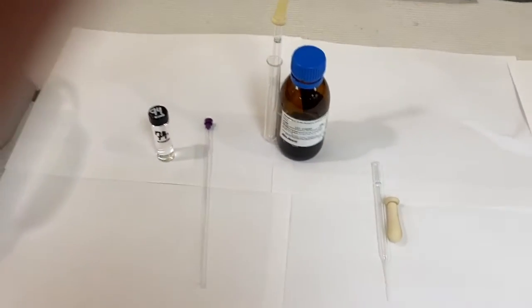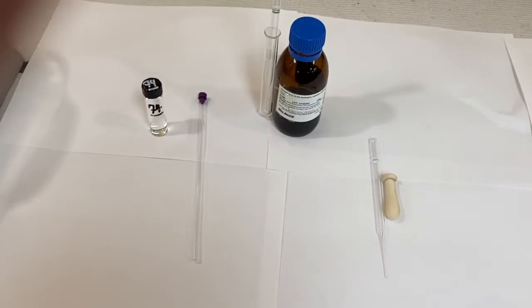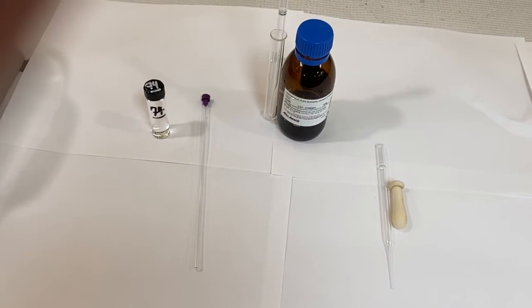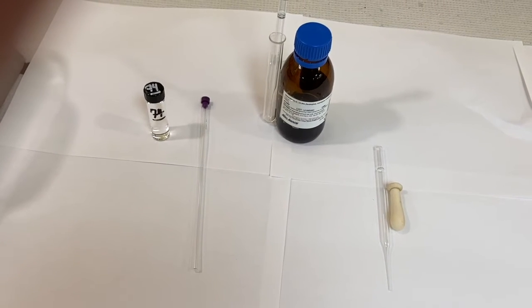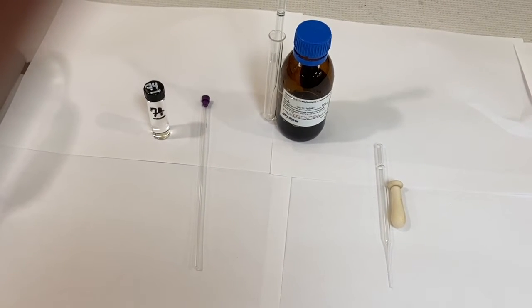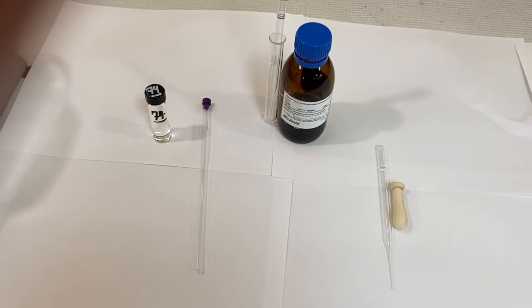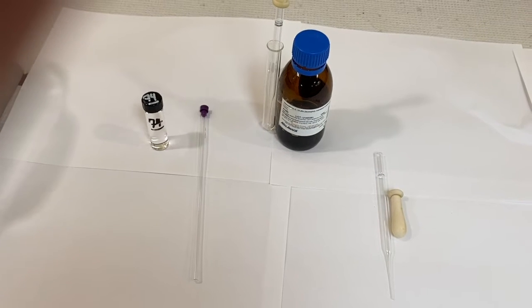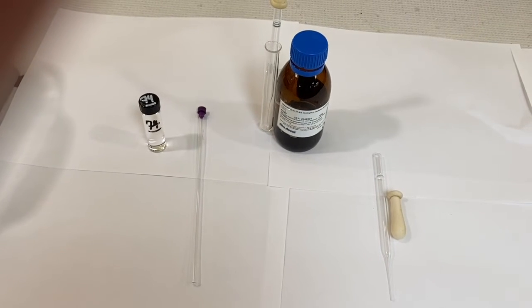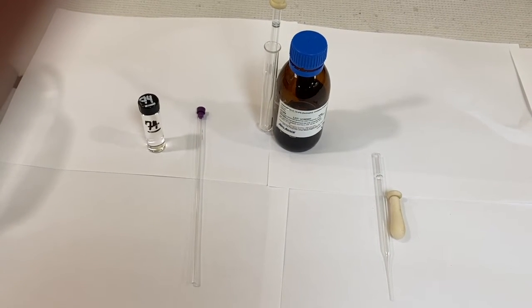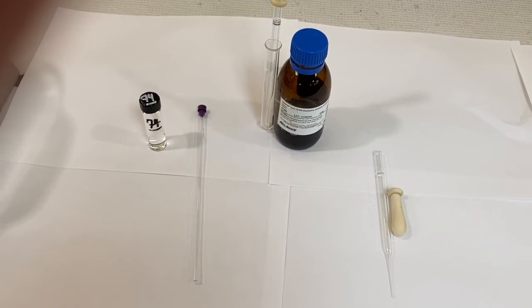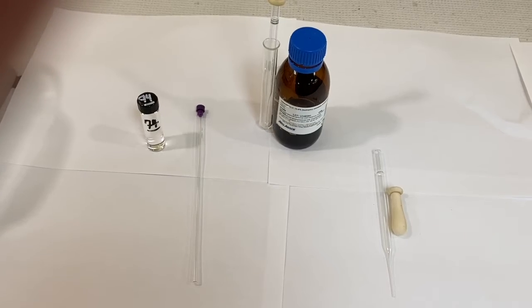One thing you want to pay attention to is your NMR tube needs to be clean and dry before you do this. It's a good practice to clean it with acetone the lab period before you use it and leave it open in your locker to dry.